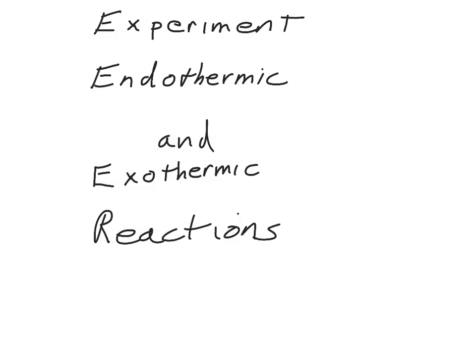All right. Are you ready to heat things up in lab? Because that's what you're going to be doing in today's experiment. Today's experiment is on the subject of endothermic and exothermic reactions. So we're going to have to start right off the bat by defining a whole bunch of terms.